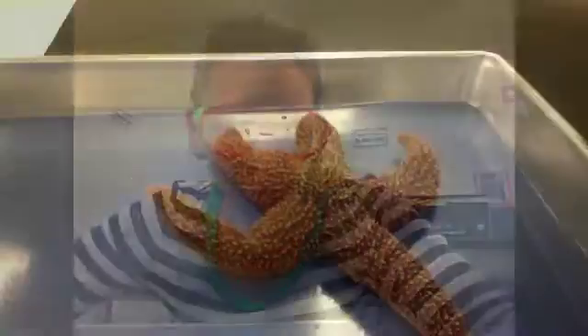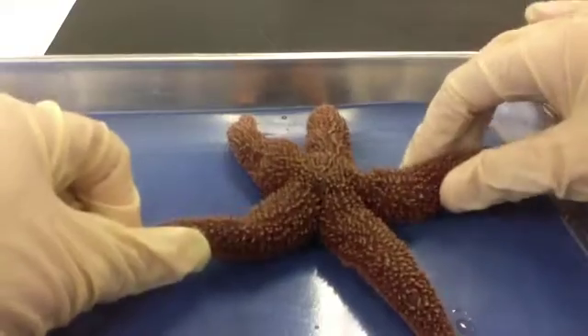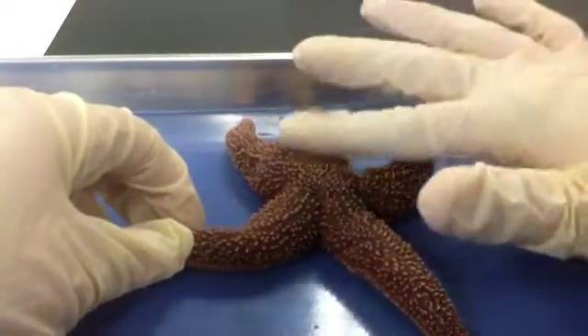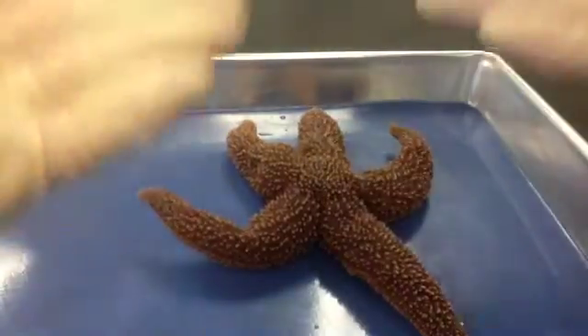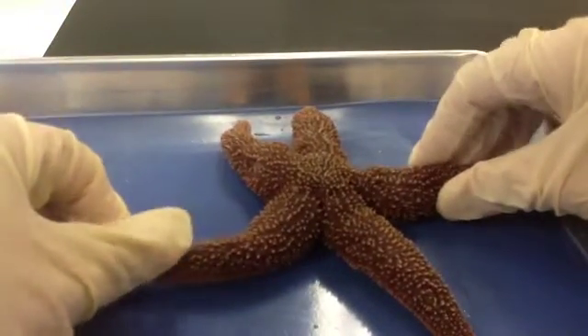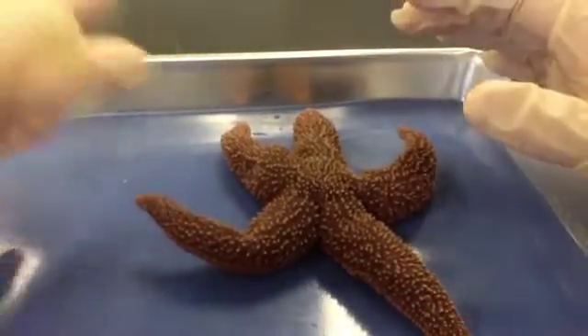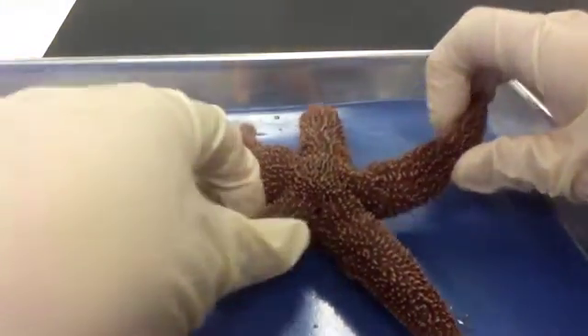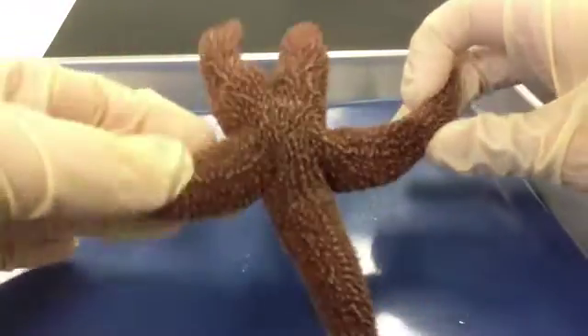So let's take our preserved sea star and put it in our dissecting pan with its dorsal, or aboral, which is its top surface, upward. Now remember, a sea star is an echinoderm, which means it has radial symmetry and is only found in the sea. Echinoderms means spiny skin in Greek, and you can see the spines on the top.